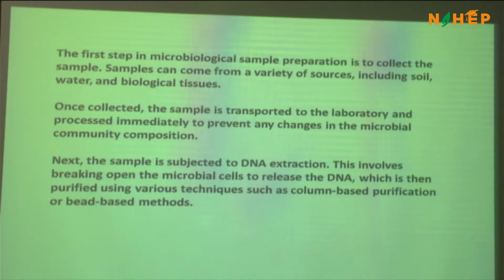You did a DNA isolation also, and a variety of methods are there. You have a lab-grown method, you have a kit method. I can share our experience, what we are doing in our lab. We never depend on one particular method of DNA isolation for downstream work. We always integrate at least two different methods. Method number one is invariably a kit-based method because it is likely to give you high quality, high molecular weight DNA for downstream analysis. And also, a portion of the sample goes for DNA isolation by adopting a lab-grown method, right? So two independent methods are deployed here to isolate the genomic DNA.